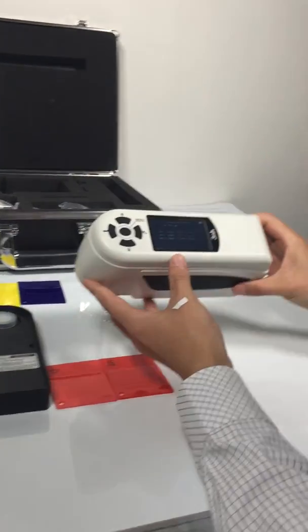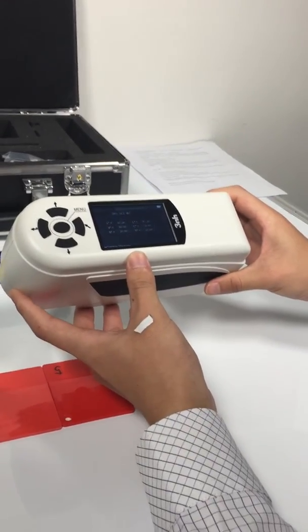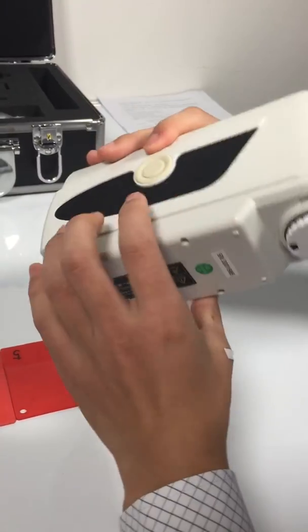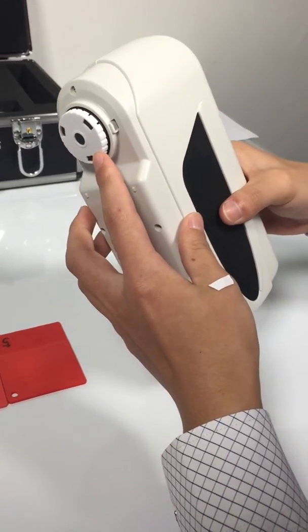This is the colorimeter NH300. Here's the power switch, the measure button, and the measuring aperture.